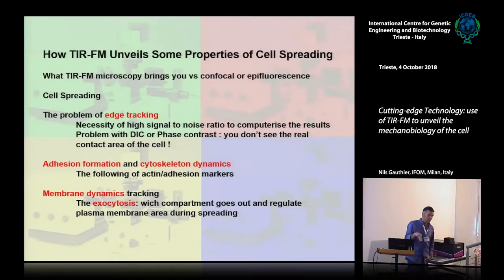Then this is very useful, the TIRF again, if you are interested in adhesion and how cells migrate, because you are really dealing with the interface where the cell is attaching to the substrate. And obviously, if you need to walk, you will attach whatever way, but at the end, you will touch the substrate.